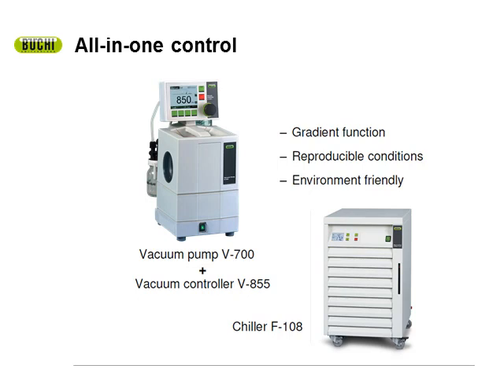And that's very important when you're dealing with parallel evaporation, mainly because of the small surface area inside each vessel. That small surface area enhances the chances of that solvent bumping. So it's very important that you have a vacuum controller that can gradually reduce that itself. You don't have to be present to turn the knob. You just program it and walk away.